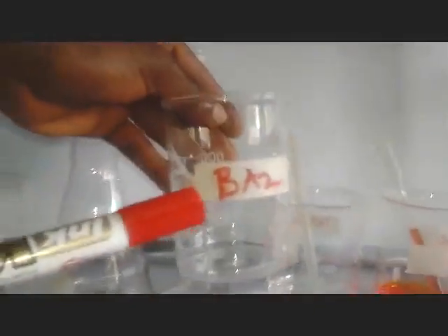You can even put it in a cup, or in any container, provided the label BA2 is there. Then you may find someone putting BA1, for example. However, it can even be DA1, FA1, any alphabet. Don't cram that it must be BA1 or BA2. It can be any alphabet. But what matters is that the solution is always given in cups, as we are going to see.